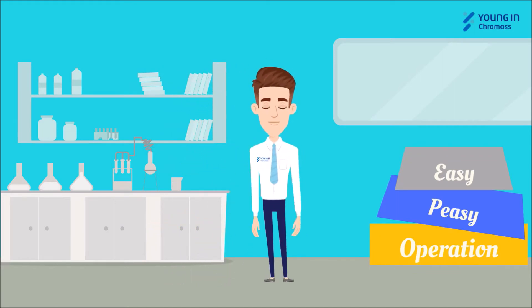Hi, I'm Chroma Doctor from Young In Chromass. I'm going to provide the easiest operation tutorial for the aquapuri system.